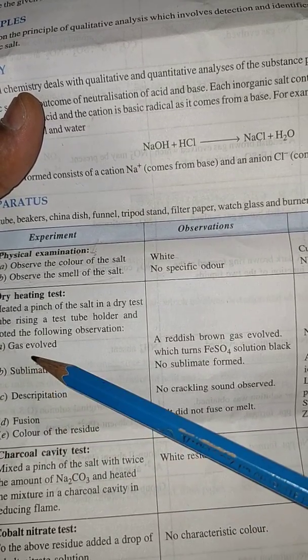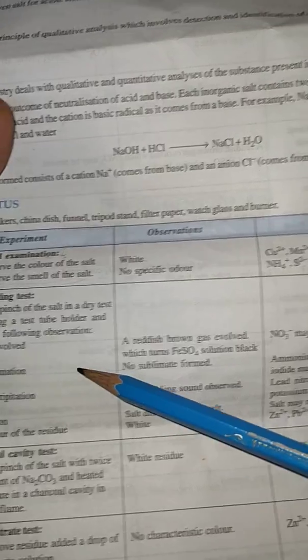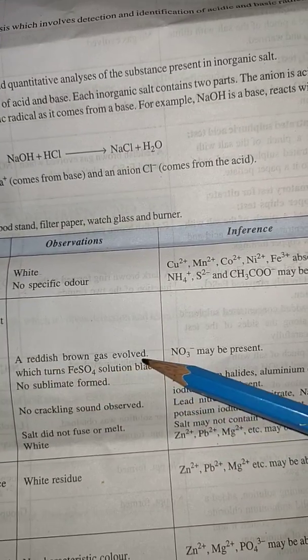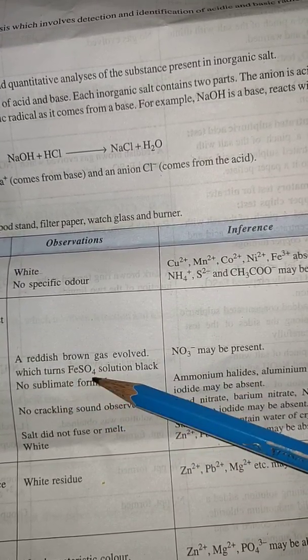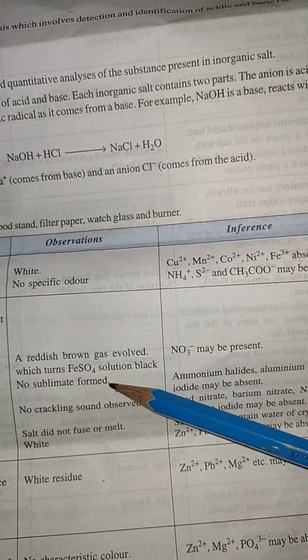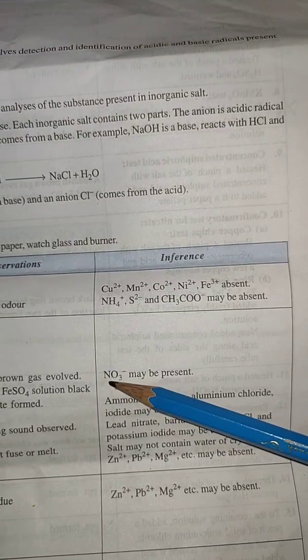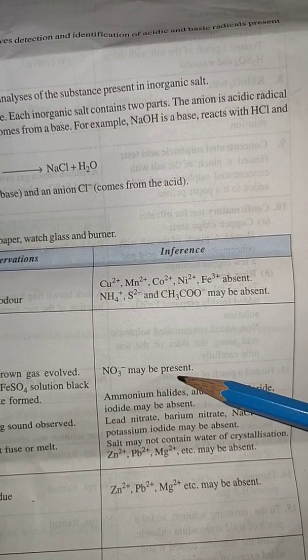First observation on the basis of gas evolved: a reddish brown gas evolved which turns FeSO4 solution black. No sublimate formed, it means NO3 minus may be present.